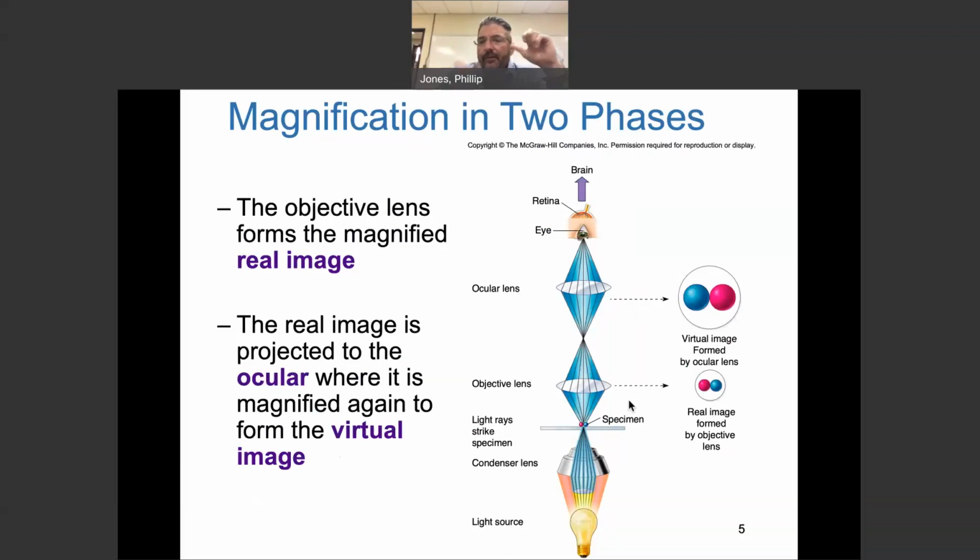And remember I said, if you move that stage away from you, the image comes towards you. If you move it left, it goes right. So just realize that whatever you're doing, don't be shocked if it's opposite.